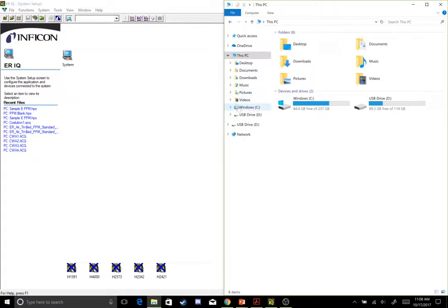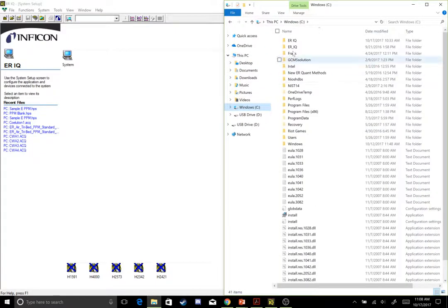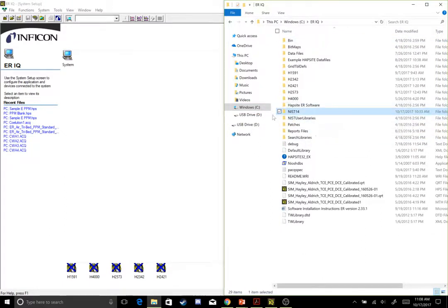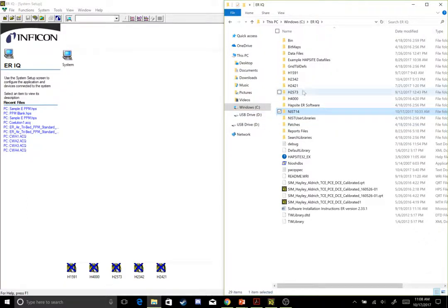So here I am going to my C drive, my ERIQ folder, and I have my NIST 14 folder placed right here. Yours might be a little different, you might have NIST 07 or NIST 05, an older version or a newer version, but just make sure that folder is in your ERIQ drive.